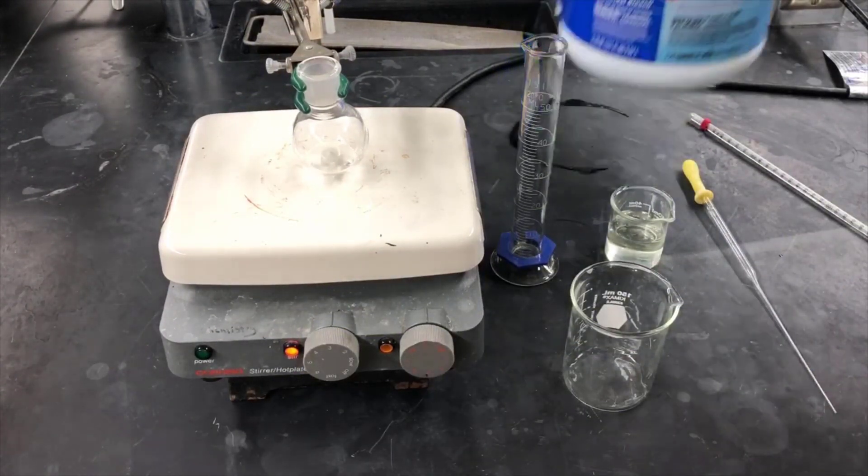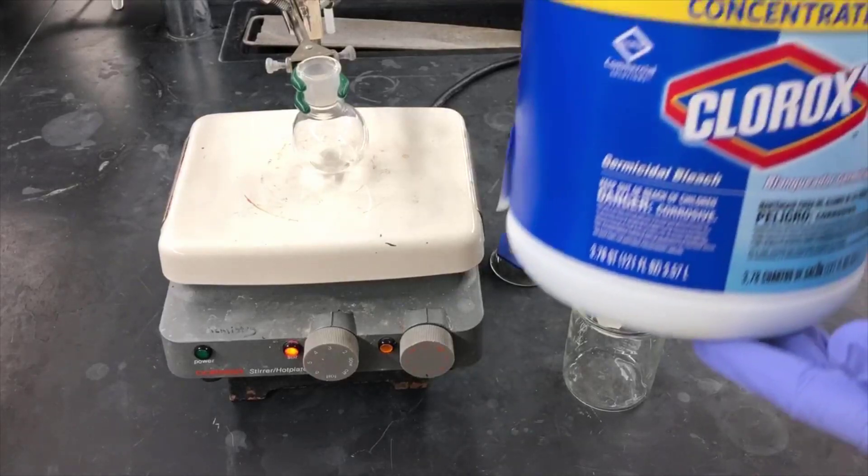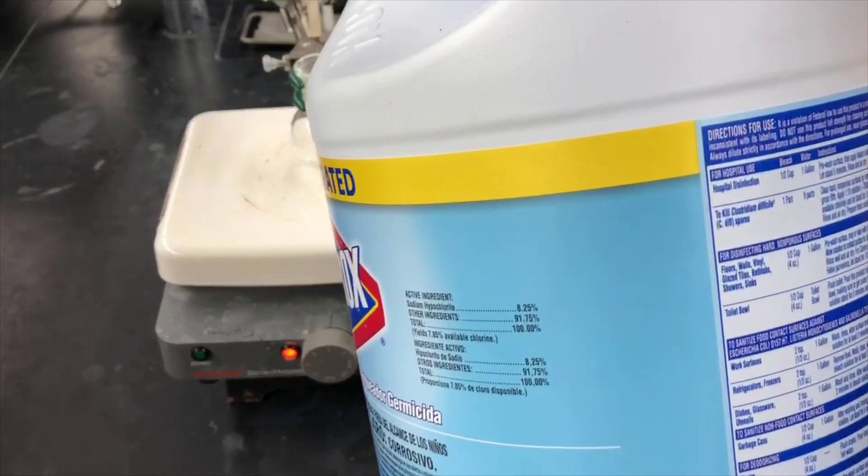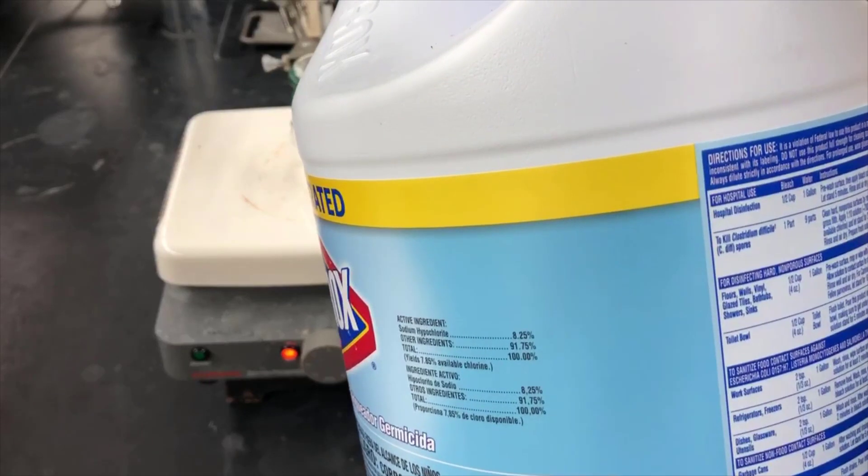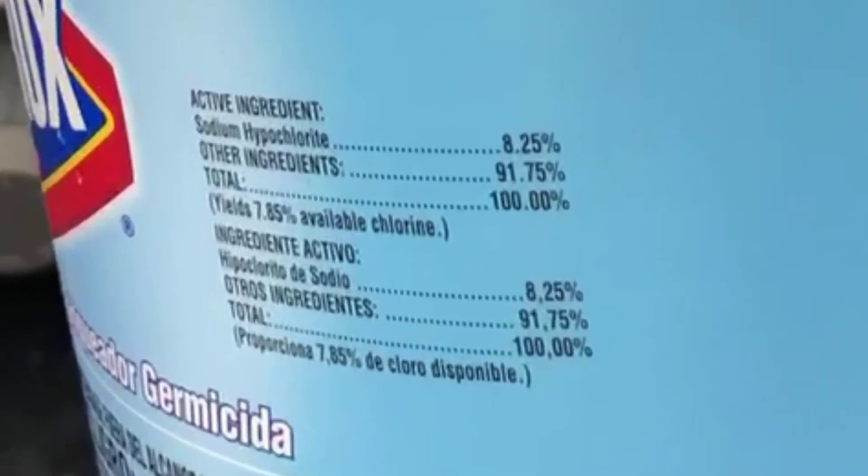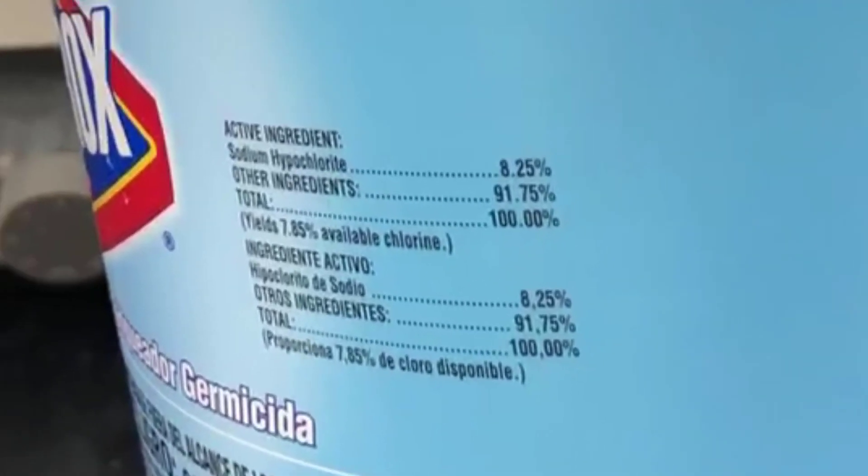Bleach is the oxidant in today's experiment. Bleach is an aqueous solution of sodium hypochlorite. It comes in a range of concentrations from 5% by mass up to around 10% by mass. Take a look at the bottle to see what you've got. This particular bottle is 8.25% by mass.